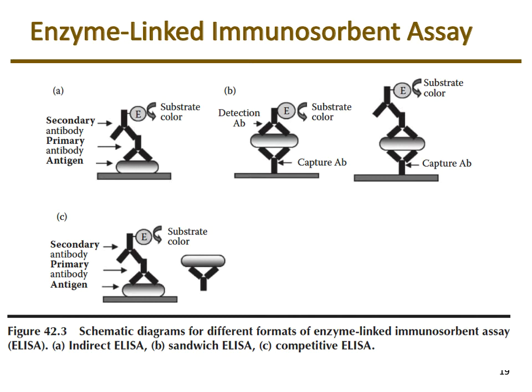So I would say that you should know that with an ELISA, there's different formats that can be utilized, and so depending upon what antibodies are available, depending upon how strongly they bind, depending upon your setup, you may use one over the other. So the capture antibody plates have to be labeled with the antibody, so depending upon whether they're using a commercially available ELISA or whether they've developed their own ELISA. Most food industries are going to use commercially available ELISAs. That may be the only method that they have available.